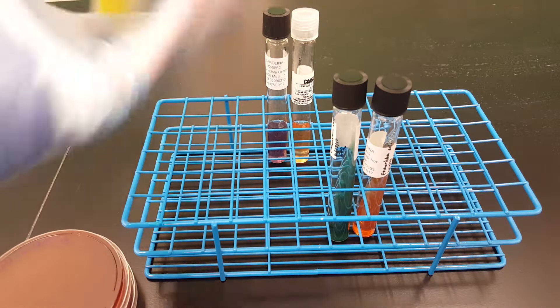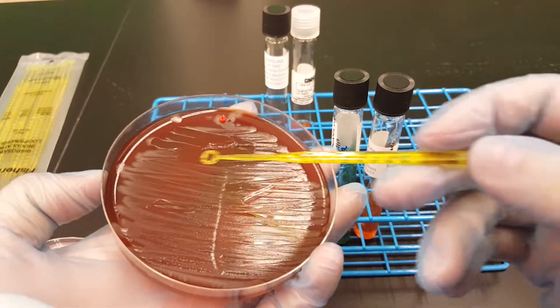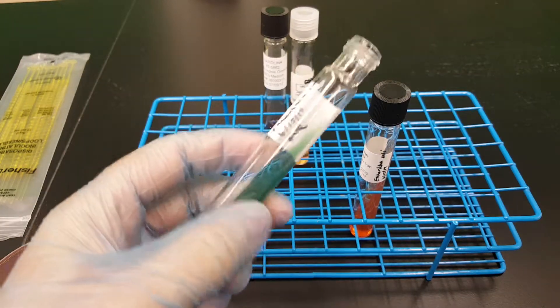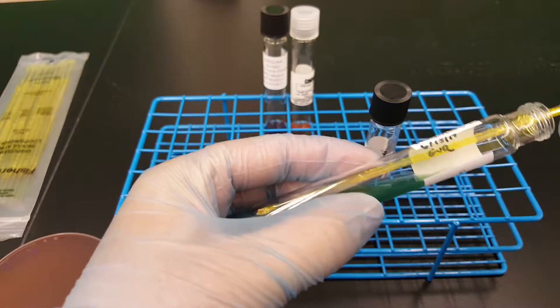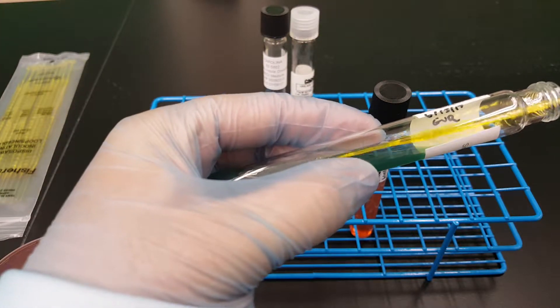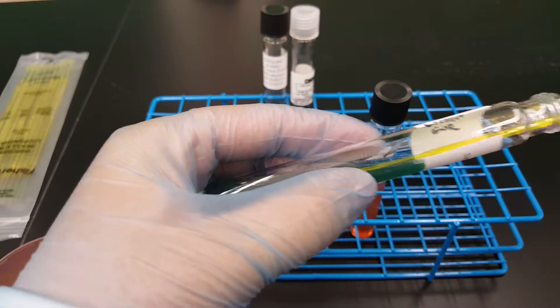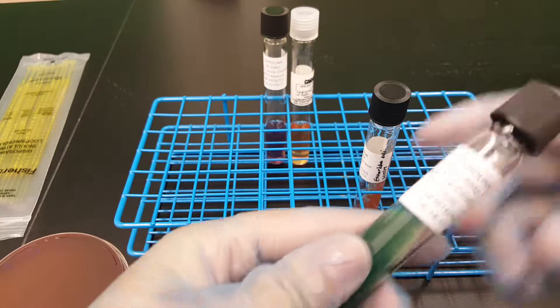Next one we're going to do the citrate slant. I'm going to use the loop on this one — you can use a loop or a needle, it really doesn't matter. Make sure you've got the slant facing up so that you can go in and just put it on there and swiggle it around. It really doesn't matter how much you put on there, just as long as you put some colonies on there. I'm going to close this one too.